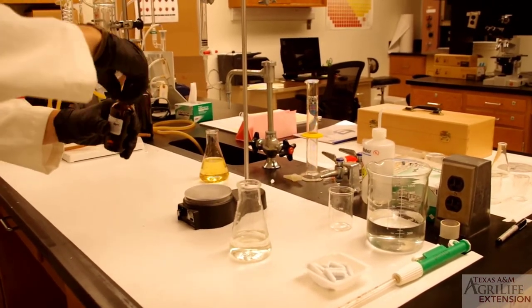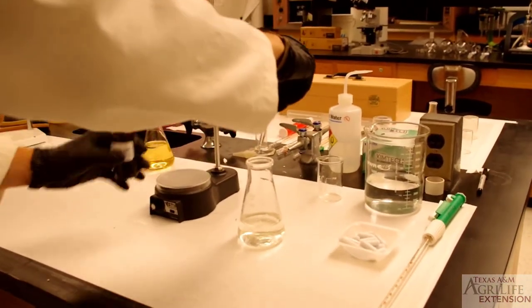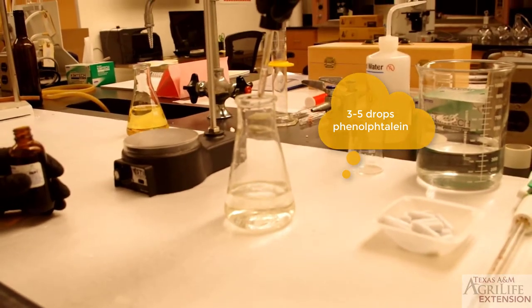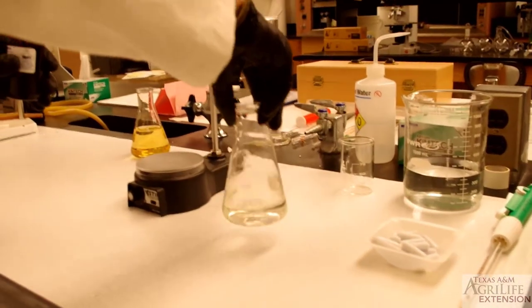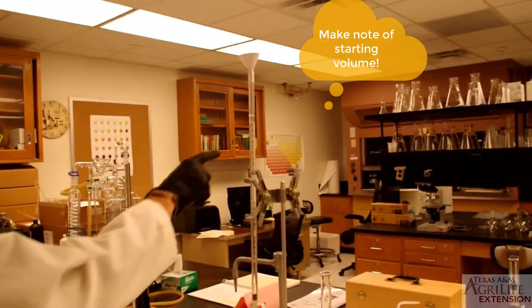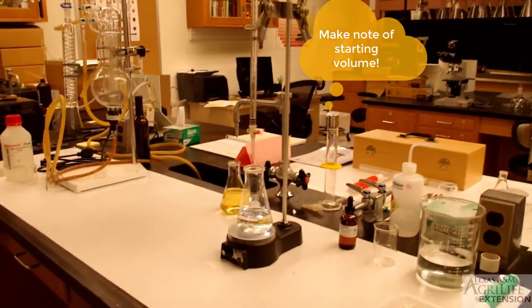To this, we add 3 to 5 drops of phenolphthalein indicator solution. And we give it a good mix. Our sample is now ready and we can start titrating. We make a note of the starting volume in the burette.